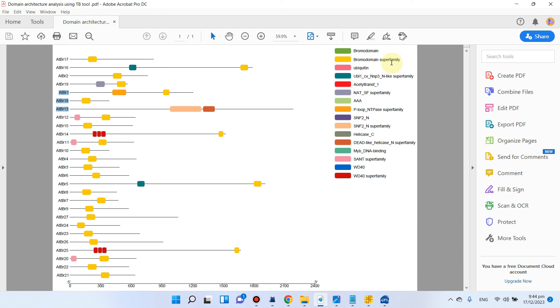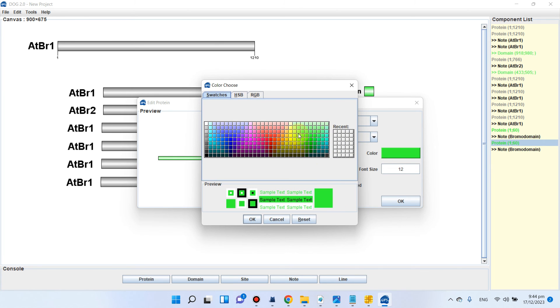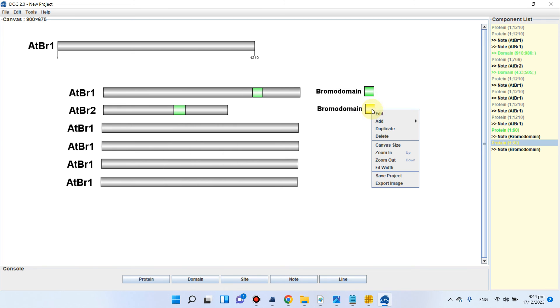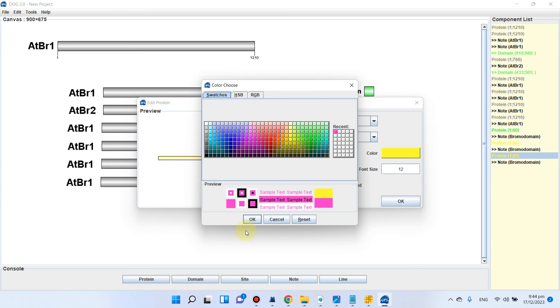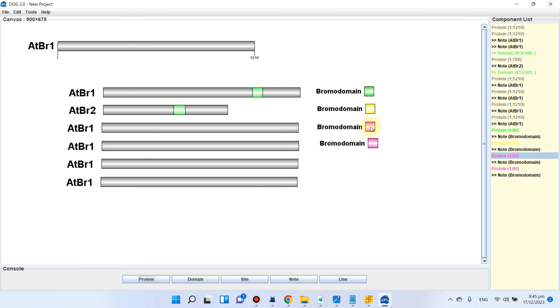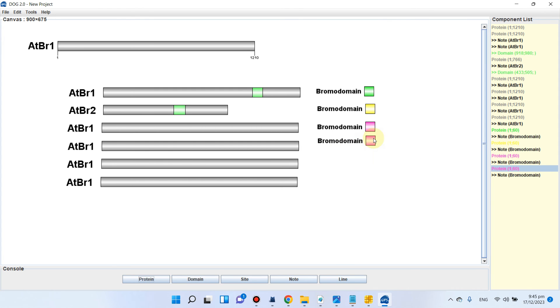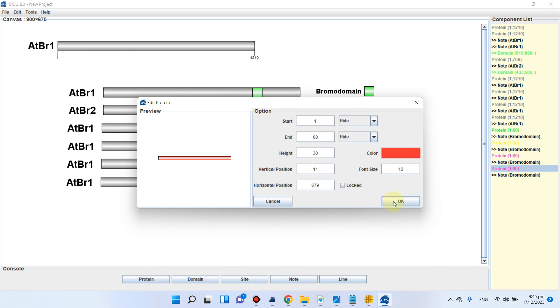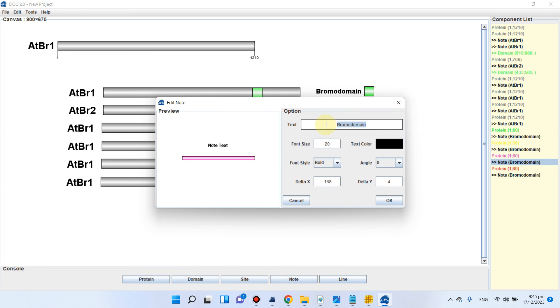Similarly, you can add other domains. For this protein there are bromo domain, bromo domain superfamily, and ubiquitin domains. We duplicate the domain entries, change colors — the next one should be yellow, then another color of your choice — and set the last one to red. We label this one as 'Ubiquitin domain.'